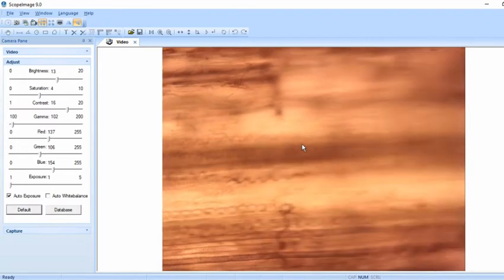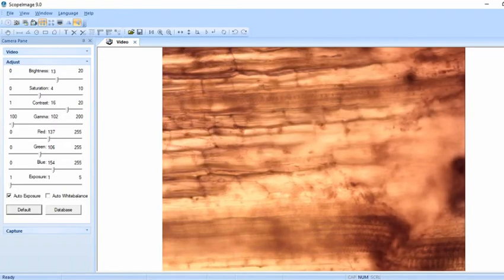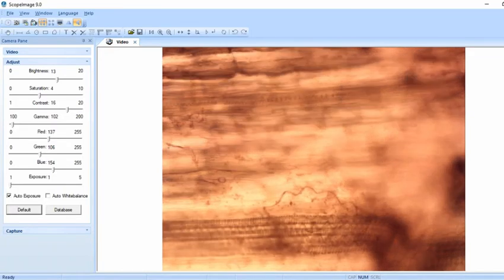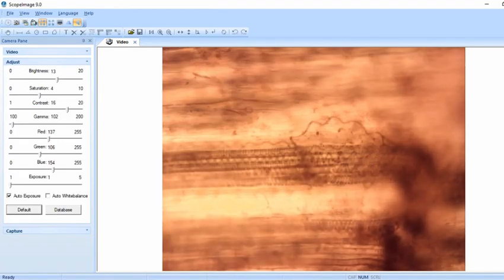Other plants I've looked at don't necessarily have this structure, but these are geraniums with a G, and they have these structures in them. They look very similar to vine plants. They have their little feelers come out, and they kind of look like this when they're small, only not this small. These are very tiny structures. Again, these are cells, so you can see how big it is compared to individual plant cells. These are tiny. In fact, some of these coils can fit in the cells.